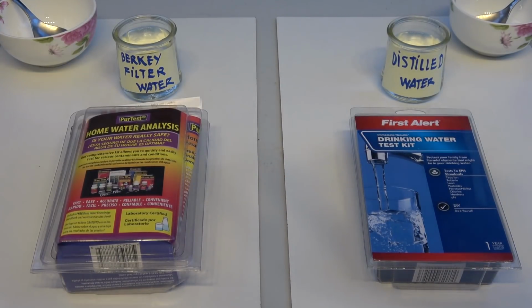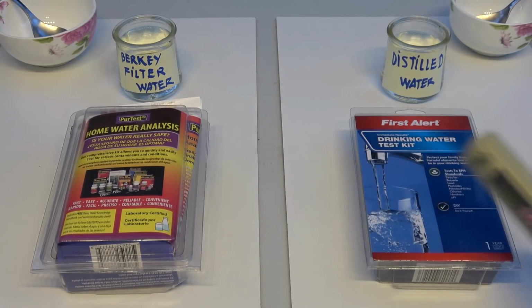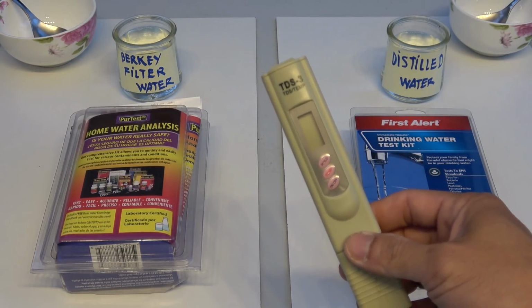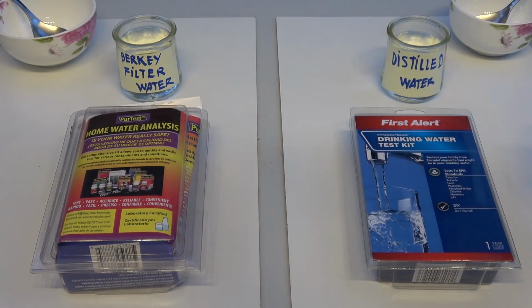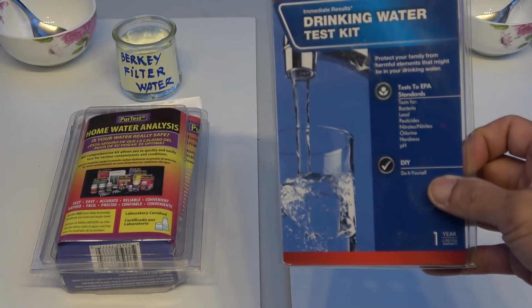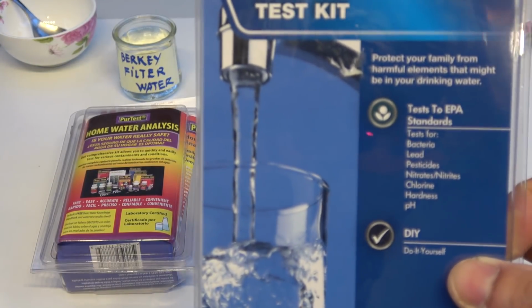I just did a review on my water distiller, and I used this TDS meter to test my distilled water to find out how clean it was. It turned out to be very clean. According to this TDS meter, I got 1 part per million, so that's almost like 0. So the water is almost 100% pure according to this. But I want to go one step further to find out if that's the truth.